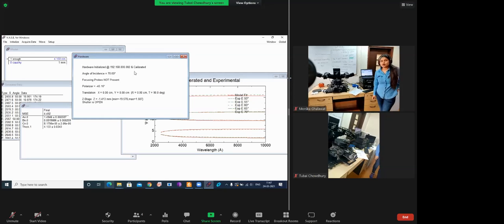Whenever you go for any new film and it is very fine, you publish a paper and propose that model for the first time for your sample. After that, whenever anybody uses that kind of substrate, they will use your information as a model. To make any kind of model, you can just edit the existing model.